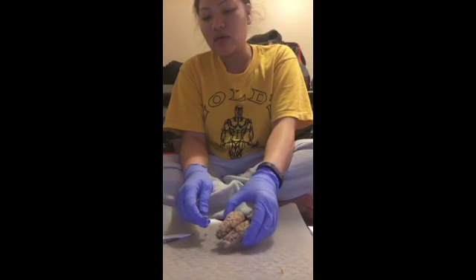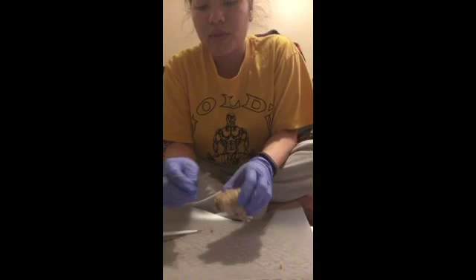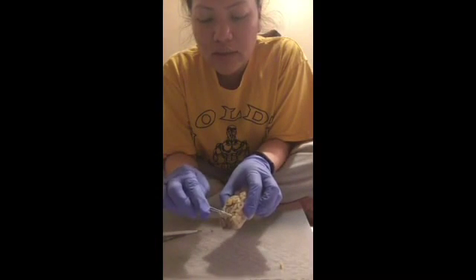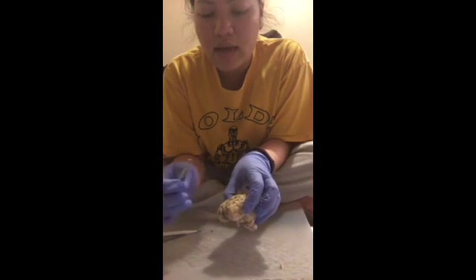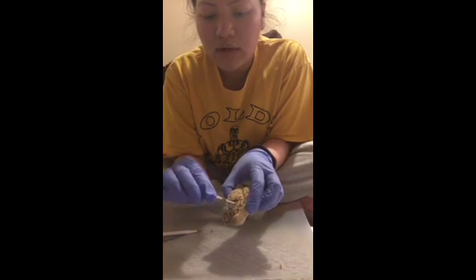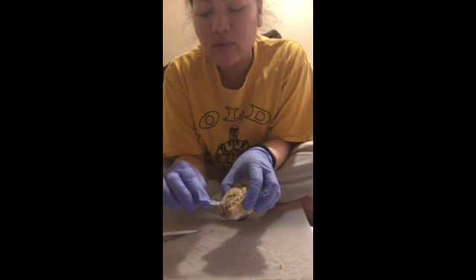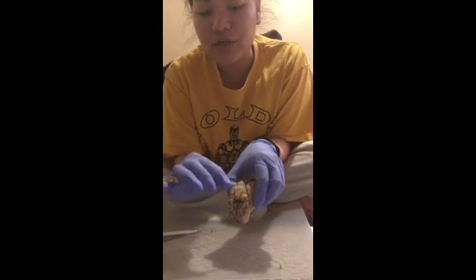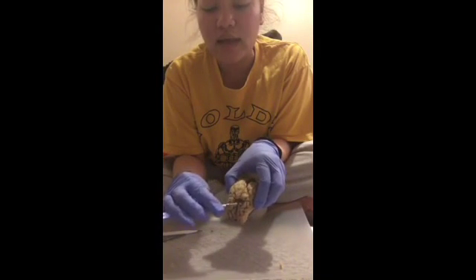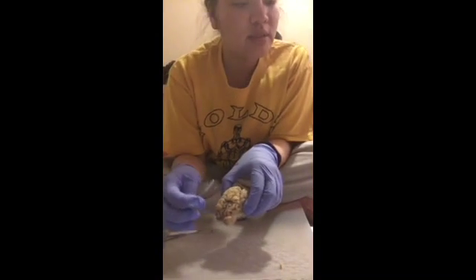As you can see, it has a lot of folds and kind of like ridges. This is the gyrus. The gyrus is the fold right here. That's the thick part, and the sulci is right here. The discolored part. That's the sulci. It's the ridge that separates each fold from one another. And the longitudinal fissure is this one. It's the midline. It separates the left and right cerebral hemispheres.